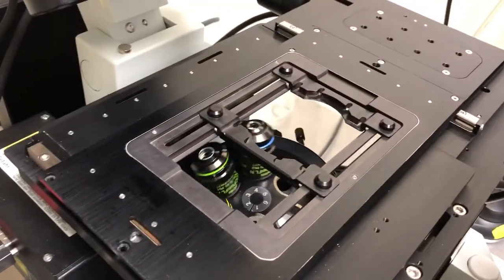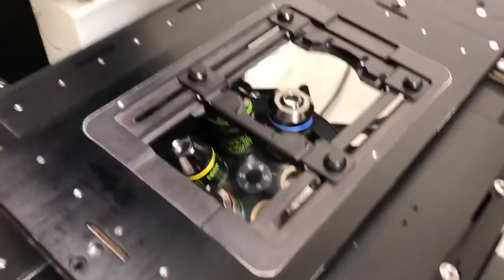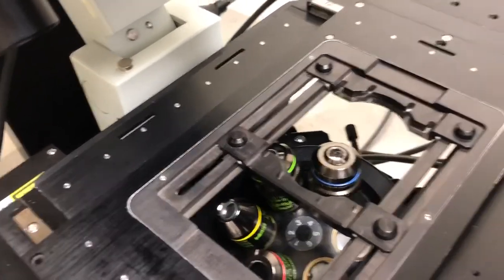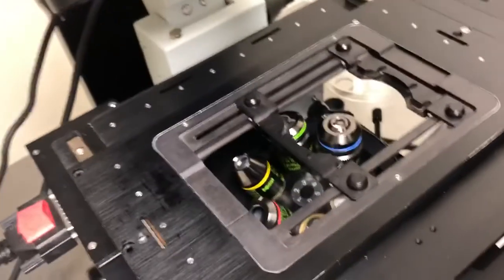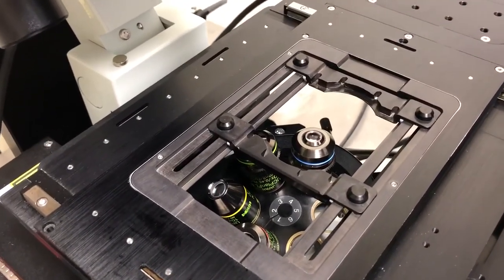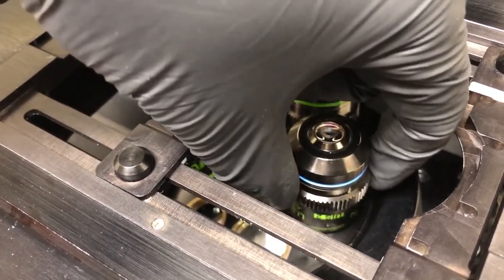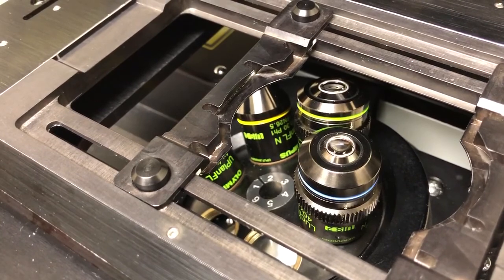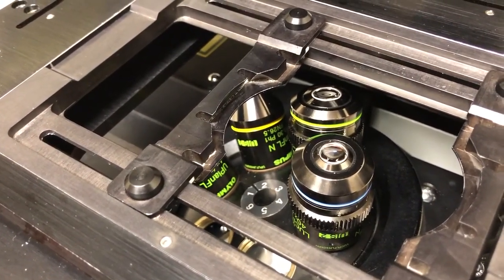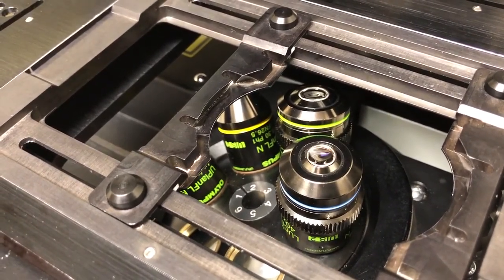There are four air objectives: 4x, 10x, 20x, and 40x. The 20x and 40x have correction collars on them, which allow you to use them either for samples with cover slips or for samples in dishes. If you look closely, you'll see the correction collar is a ring with a groove that can be turned. Depending on the position, the objective will be optimized either for a cover slip or for a multi-well plate. There is no rule as to how that is set by default, so you should always check it before imaging.